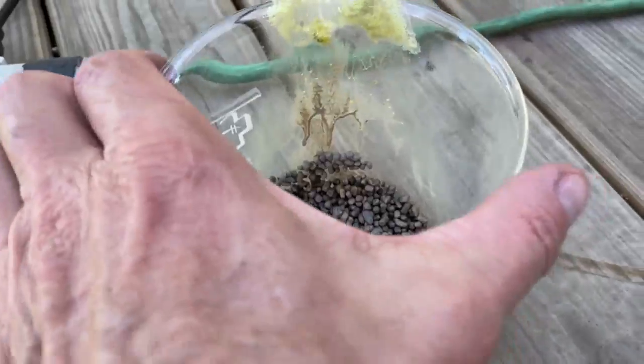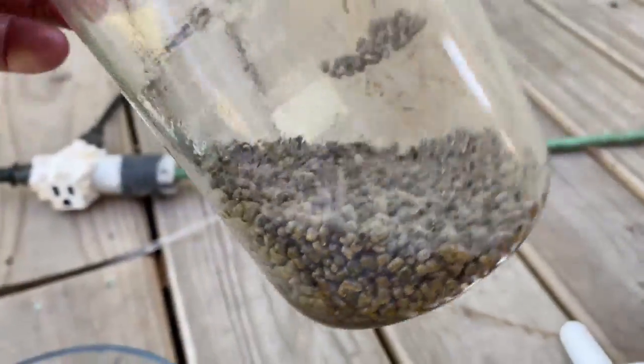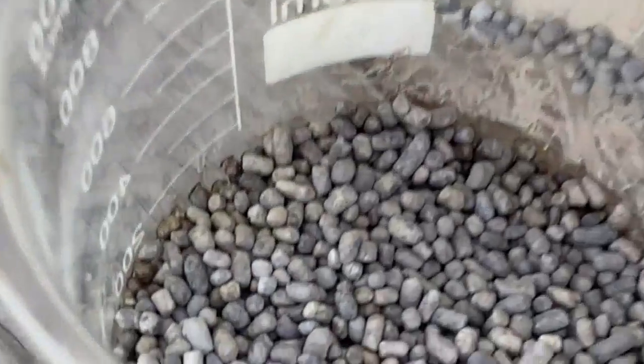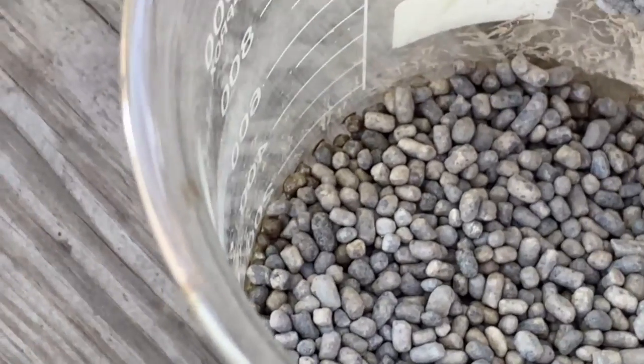This method seems to be far superior to what people are showing on YouTube. I didn't like what I was seeing there, so I decided to go my own route. So there's that material — it dissolved everything but that stuff, basically.